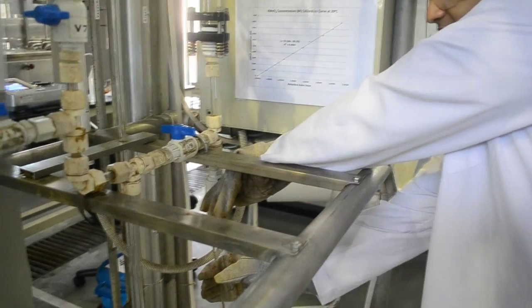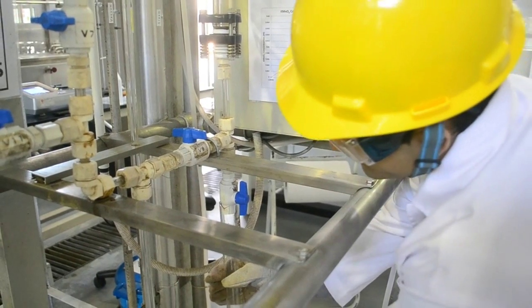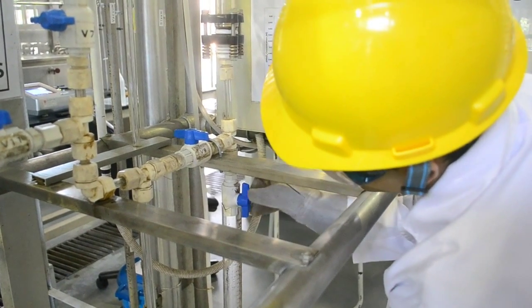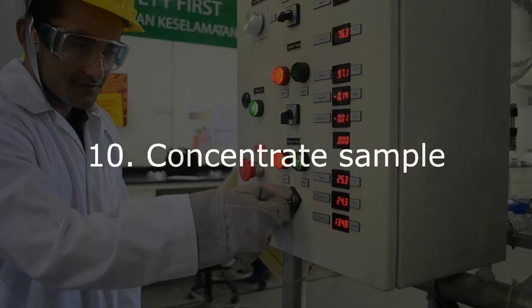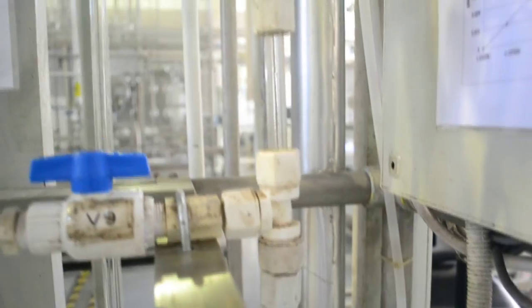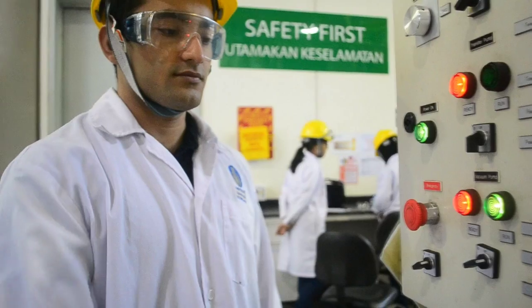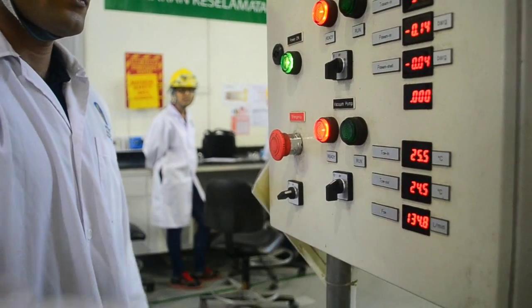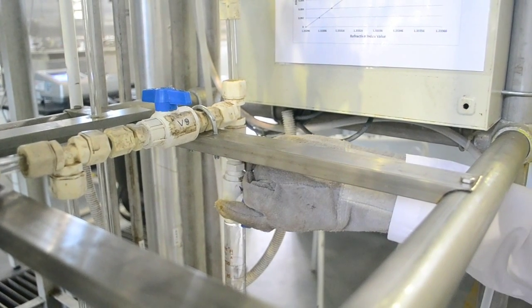The first sample taken is the condensate, which can be taken by easily opening valve 12. The second is the concentrate. Turn on the vacuum pump and the liquid will be transferred to the condensate receiver tank 2. After all the liquid has been transferred, collect the concentrate sample.